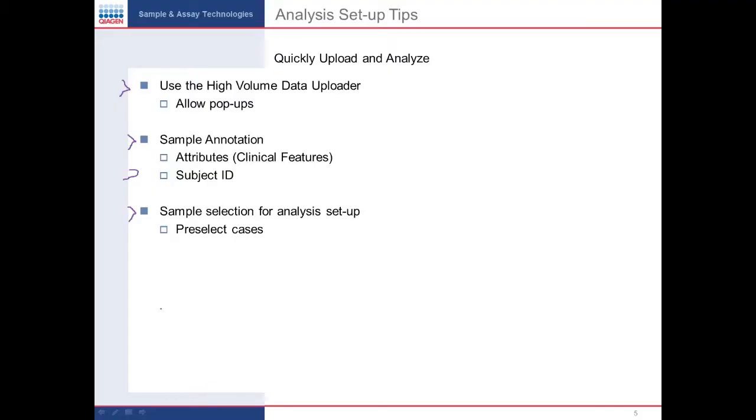Let's go back to my presentation here. Of using the high volume data set uploader, adding annotations. I didn't mention it, but you can also add subject IDs, which is really important. I guess I'll go ahead and bounce back real quick.